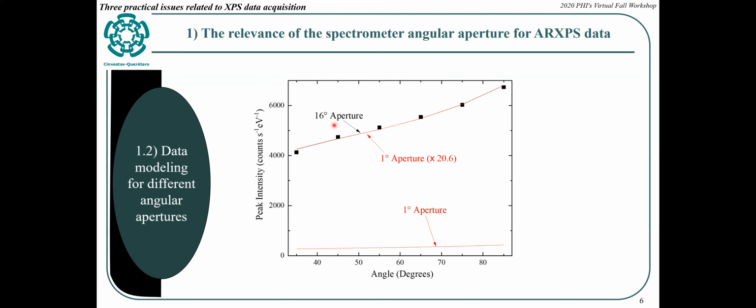So we opened the spectrometer to the maximum angular acceptance, and we are able to reproduce the data very well.